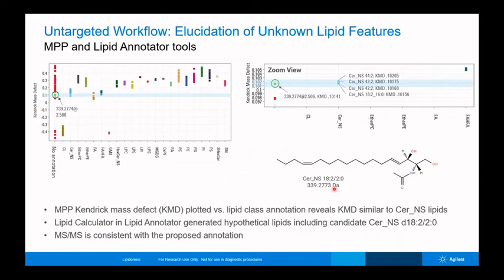So the bottom line is using all these tools can help you to get more in depth into the results, into the annotation of these lipids, regardless, actually, even if they are not in a particular database, it's not impossible.